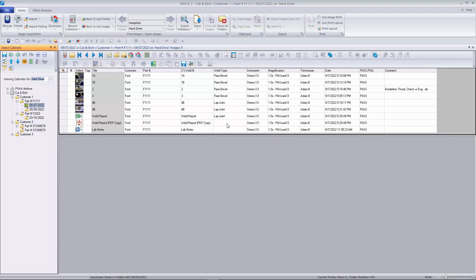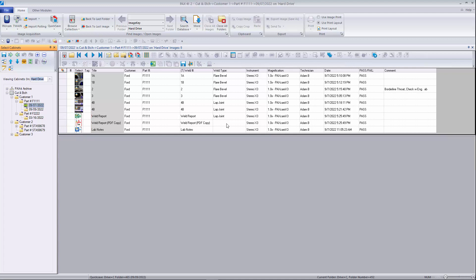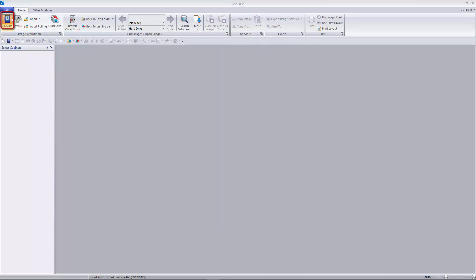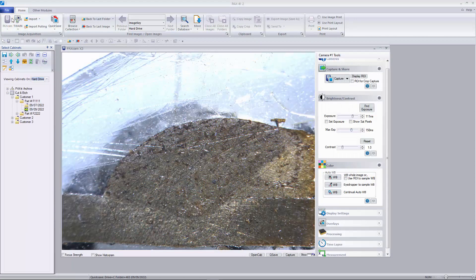Many other file types, such as PDFs, spreadsheets, documents, and more, can also be stored in the Paxit database archive. The PaxCam microscope camera is launched within Paxit to capture directly to project folders in the database.